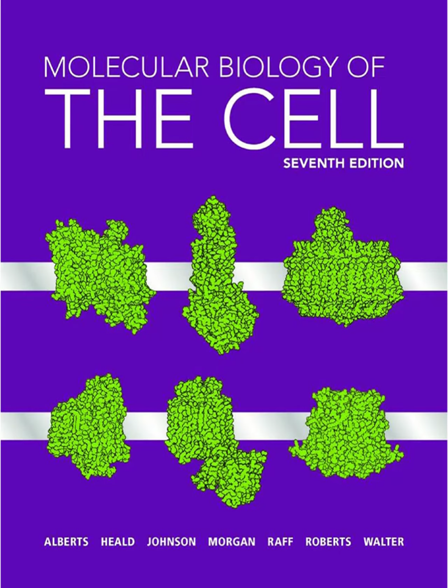Other methods play tricks with that point spread function, the blurry spot from a single light source. One is STED, stimulated emission depletion microscopy. STED. Sounds intense. It is. The idea is to make the effective fluorescent spot much smaller. You use two lasers, one to excite fluorescence in a diffraction-limited spot, just like confocal, but then a second, very strong depletion laser, shaped like a donut, is overlaid on the first spot.